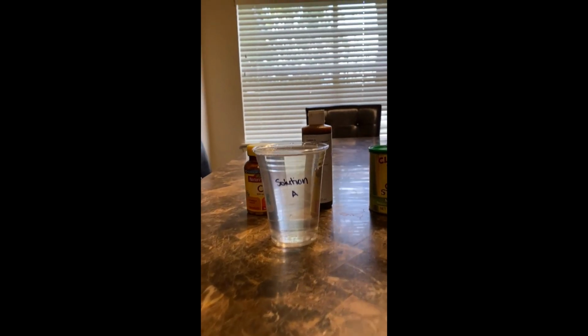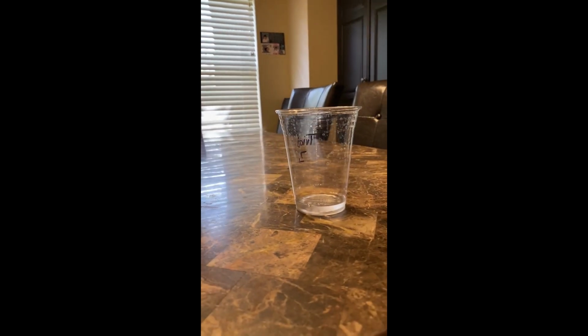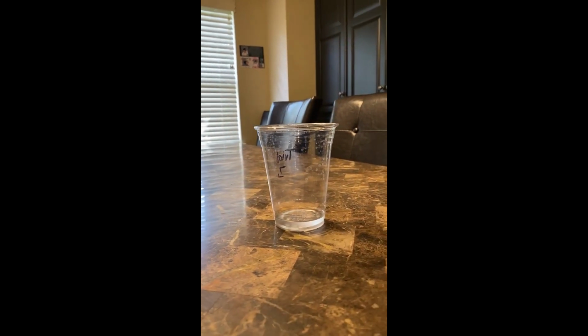So I have my two solutions. I have solution A and solution B, and then I'm waiting. This is a little test. It's a mix of the two. I'm waiting for it to change color.